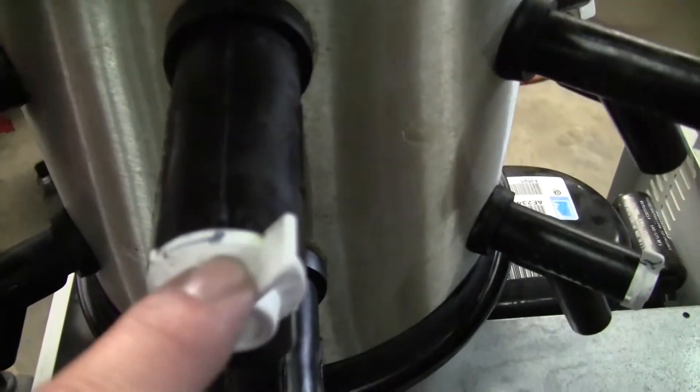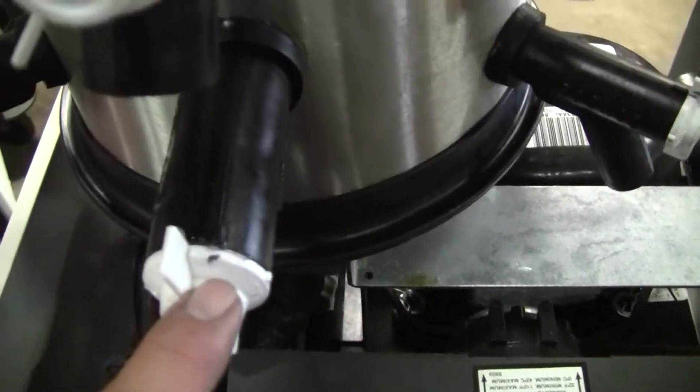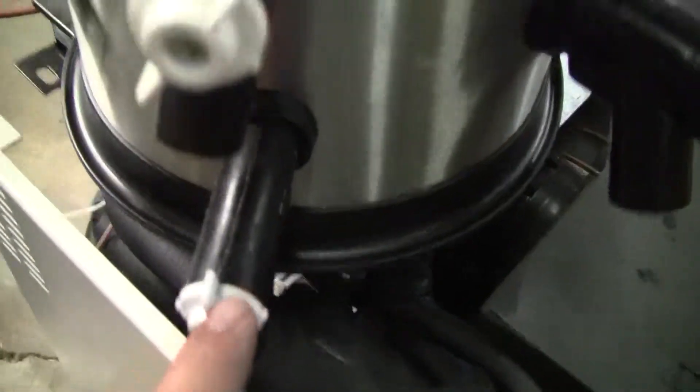We've marked on every one where the closed stop position is. It's the best where we can get it.